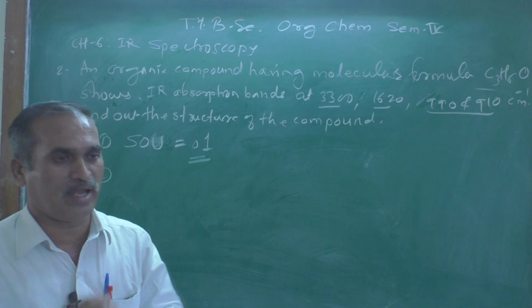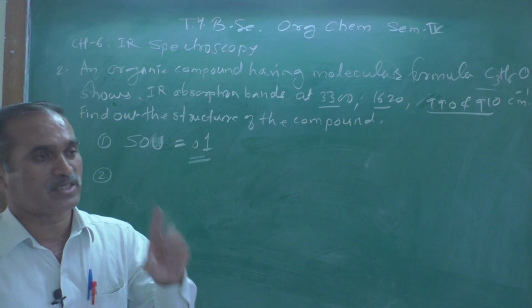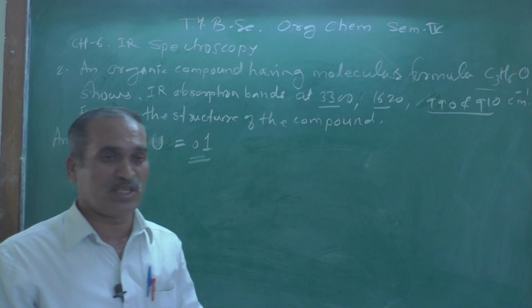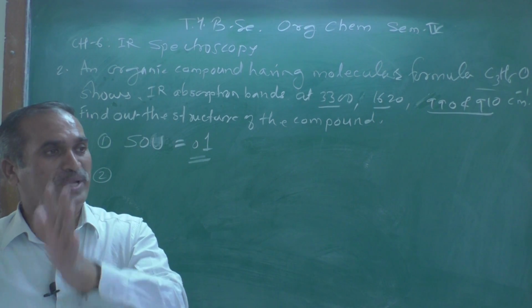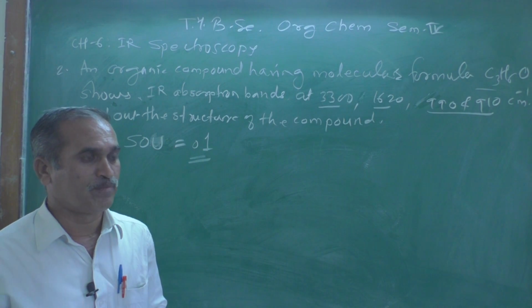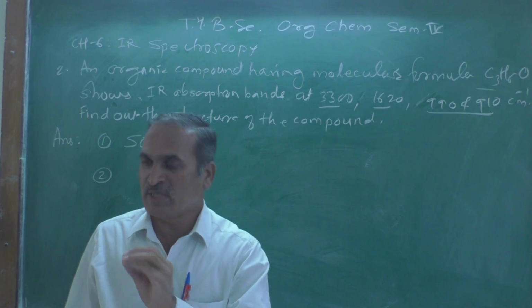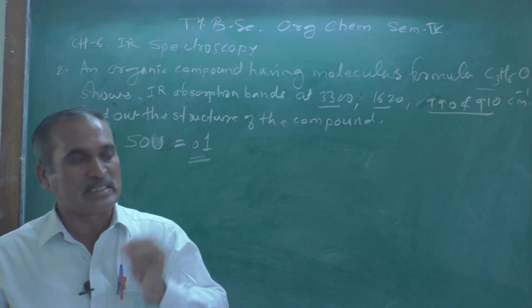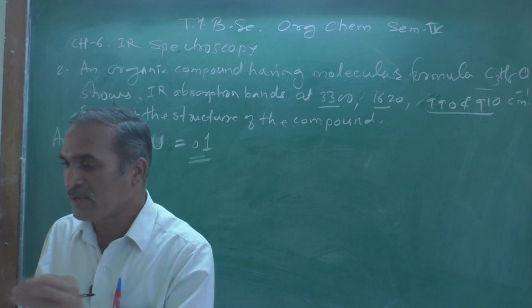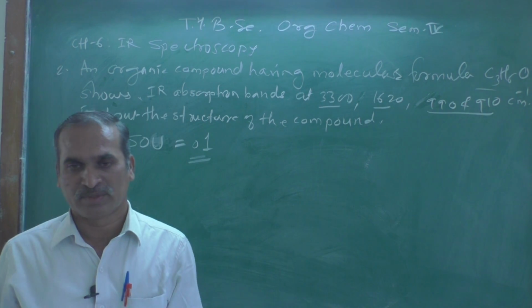What kind of functional group? As we know, IR frequencies are due to the presence of particular functional groups, and therefore from these signals or bands we can easily determine what kind of functional groups are present in the organic compound.